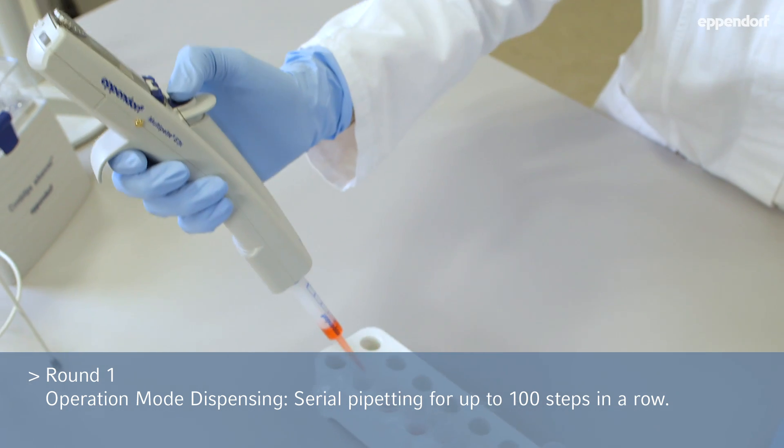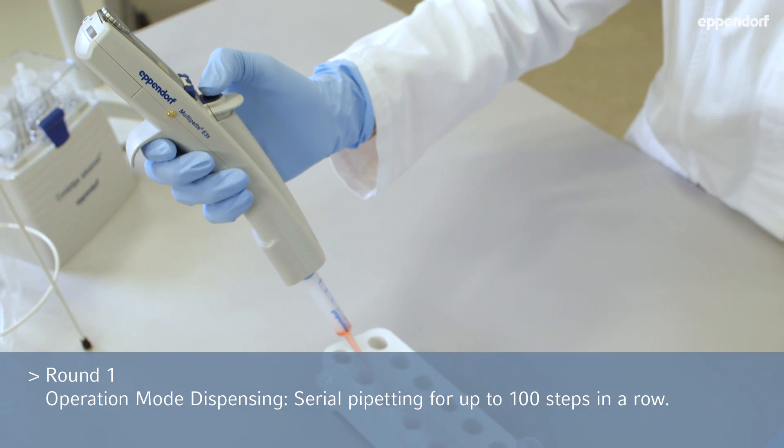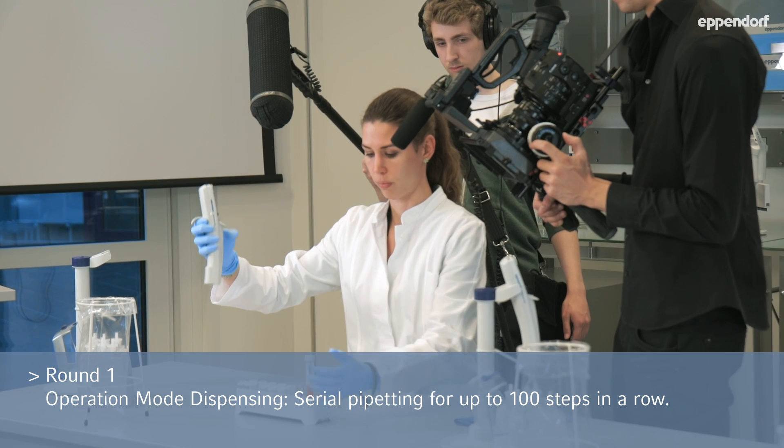Two more. The last tube. All is gone. Perfect.